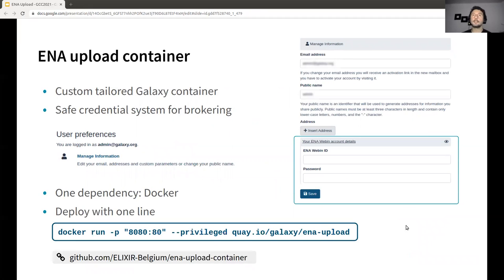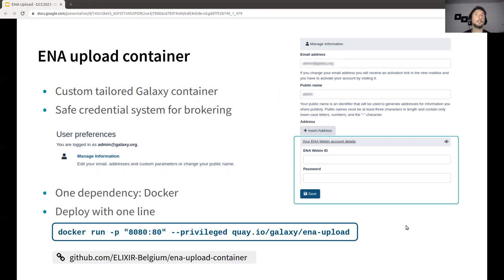The second option is a small ENA upload container we created, which contains not just this tool but also all the pre-processing tools that might be needed before submission. You just download the container and it will run the Galaxy instance locally. You can access the tool and fill in the ENA credentials in the user preferences. In this case, you only need one dependency, which is Docker, and you can run it locally.